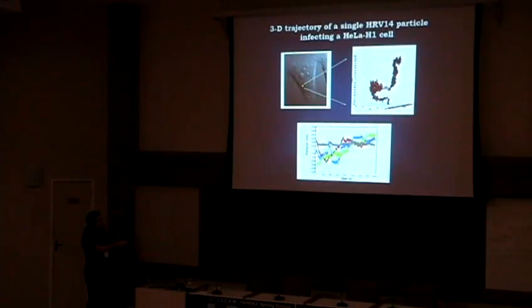These are all the values of X, Y, and Z we can recover from the experiment, and this gray line is fluorescence intensity. Since we have the laser pointing at the particle during the whole experiment, we have the fluorescence emission trace of the particle. So we can use that to get information about conformational change. At the same time, we track the particle. If you pay attention, you'll be surprised that this is 1,600 seconds, and fluorescence intensity is constant. There is no bleaching. We will try to explain that, and actually it's very interesting.